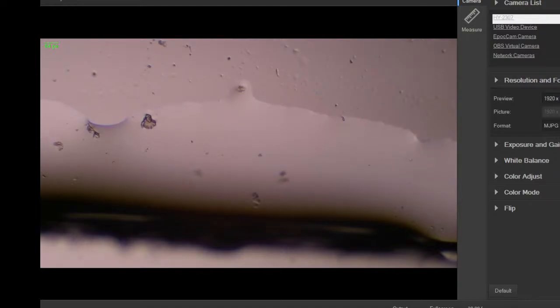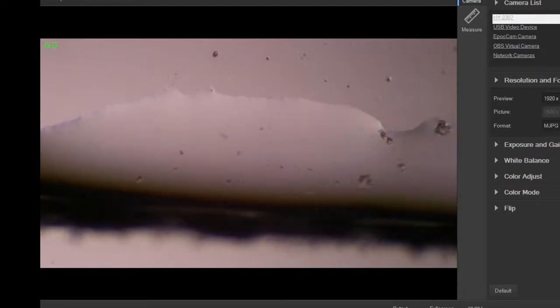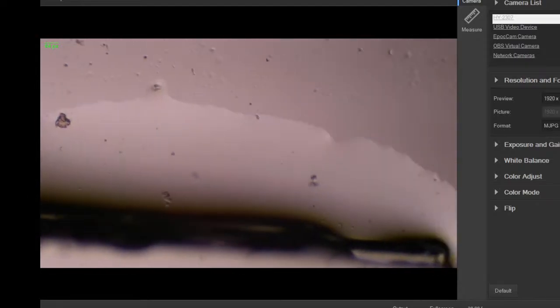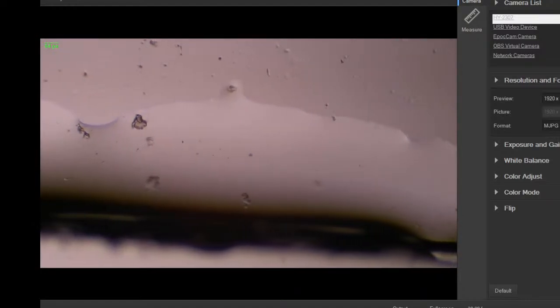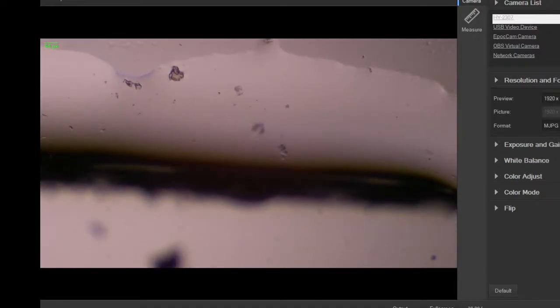In this case, bulging up instead of bulging down. And it gives it a 3D look because the surface tension makes it form that kind of curvature. Same thing that makes it basically form a spherical raindrop that you'd see when rain falls, and then wind will basically change the shape. But all this movement is not life-based movement, it's just simple diffusion.